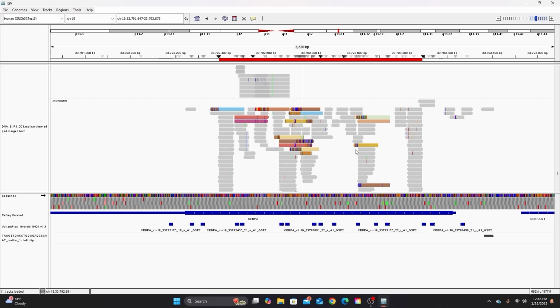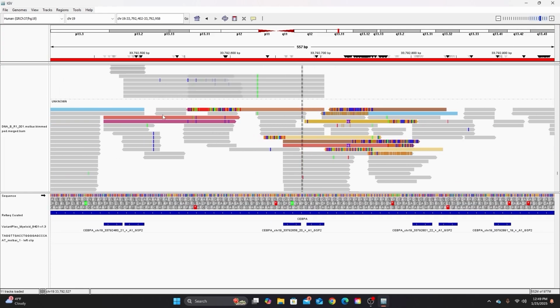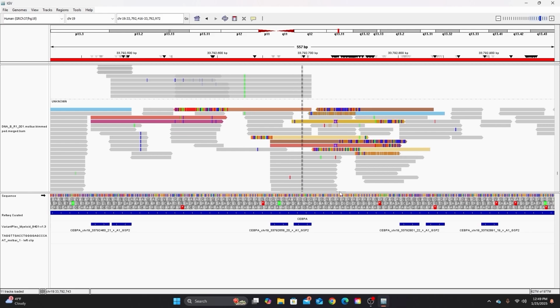So even though this fusion isn't real, we can still look at how we would interpret fusions here. I've cleared out the tracks. If we had a real fusion, they would look something like this, although there would be more consistency across inserts. Each one of these is colored for a different chromosome, which is why I don't believe any of this.